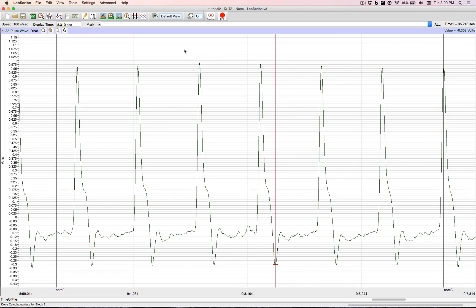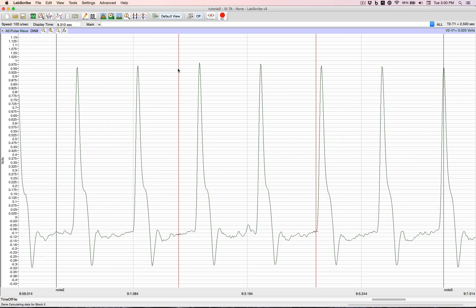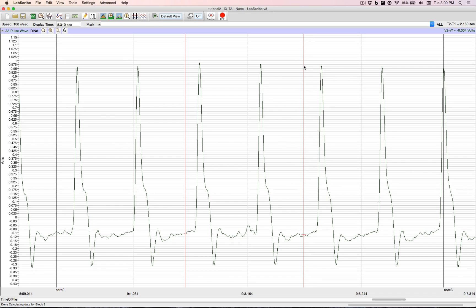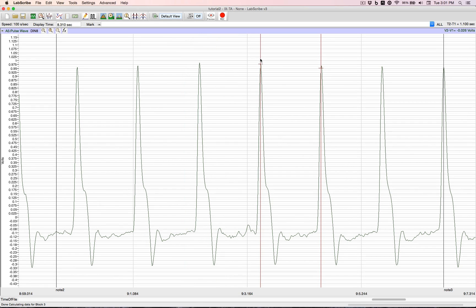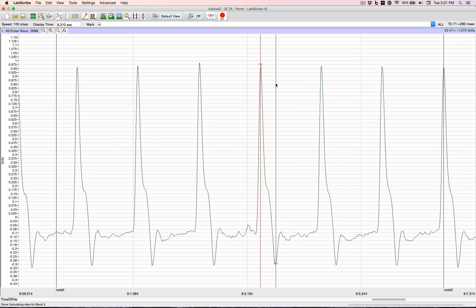Now, to make things easier, we take and click on the double cursors. And now we have two lines, both freely movable. Instead of giving individual values, it gives us the differences. So now it's a lot easier. We take one cursor, put it on one peak, take the other cursor, put it on the other peak, and there you can see the time. If we move top to bottom, we can now get the amplitude.